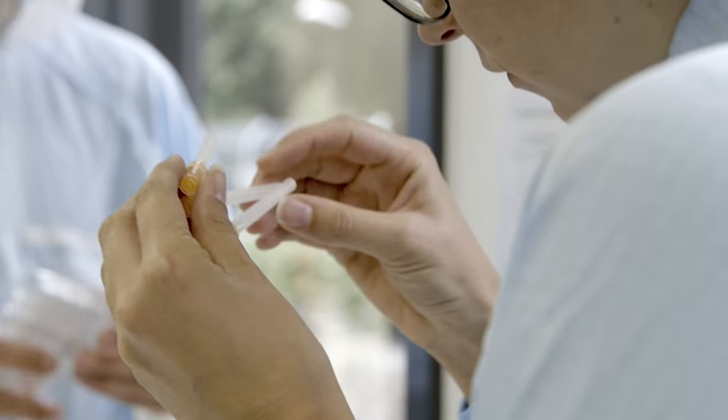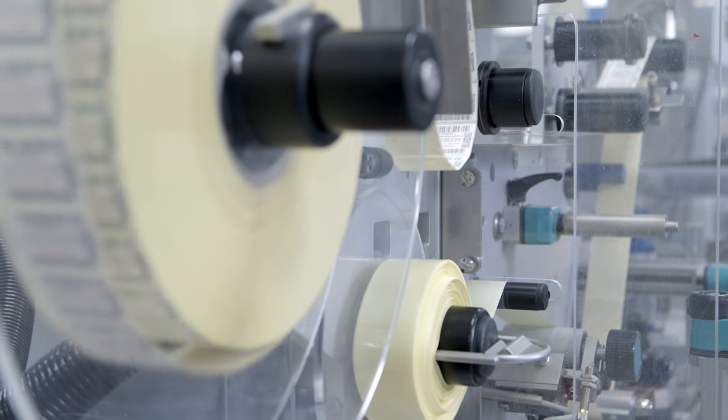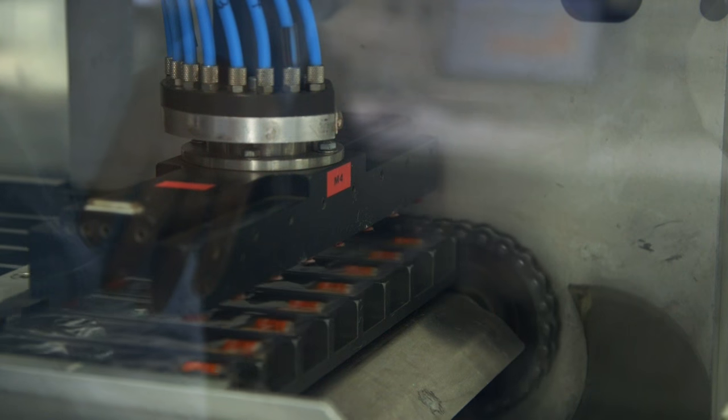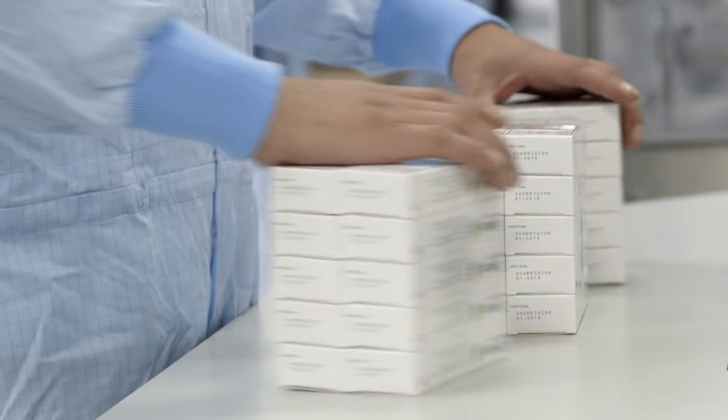The manufacture of our bulk antigen takes us about 30 days, followed by another 30 days which is necessary for the formulation, filling, and packaging of the vaccine.